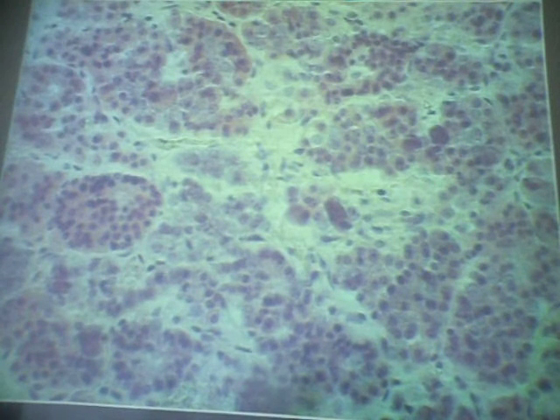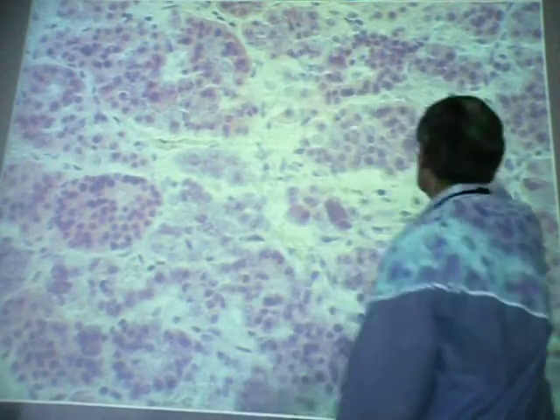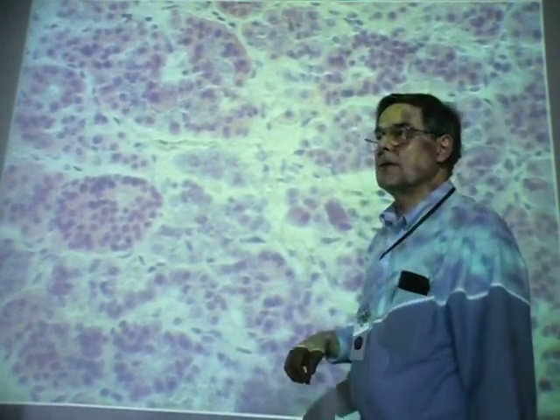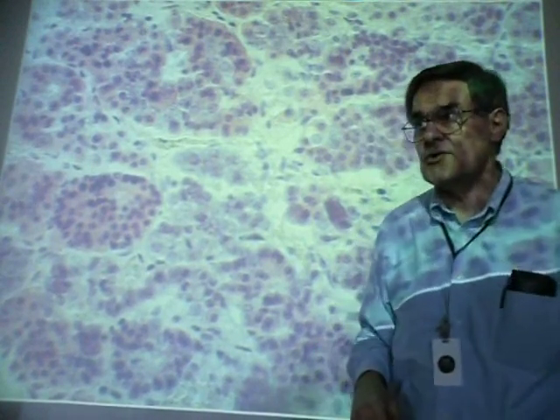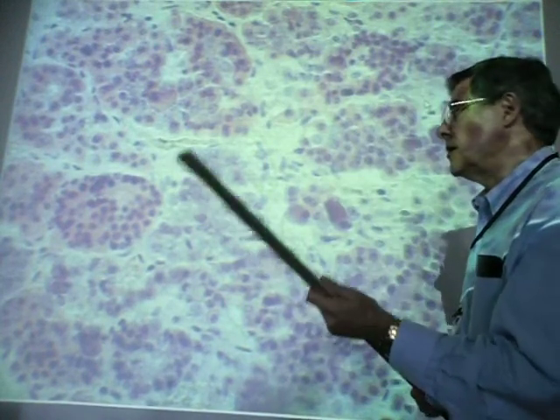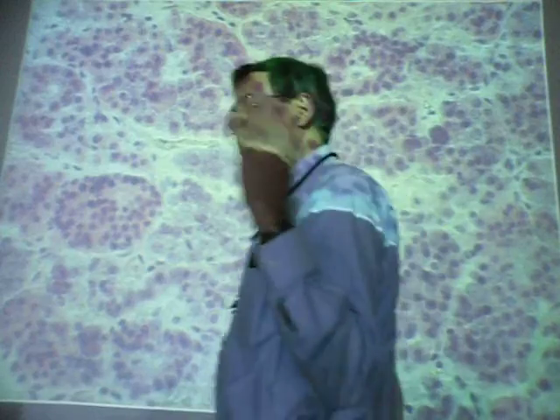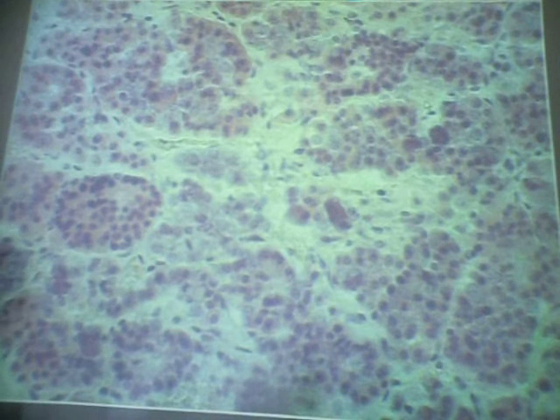So in males, it stimulates sperm production by the testes. So the basophil cells are the purple, dark shading ones. Right, the acidophil cells, these dark cytoplasmic cells. Okay? Oh, we're not all basophils then. Basophil cells. Well, these are basophils. Okay, I thought you said acidophil. No, acidophil is prolactin and human growth hormone. Yes, okay. So we're talking about basophils. All right. Thyroid stimulating hormone and follicle stimulating hormone.